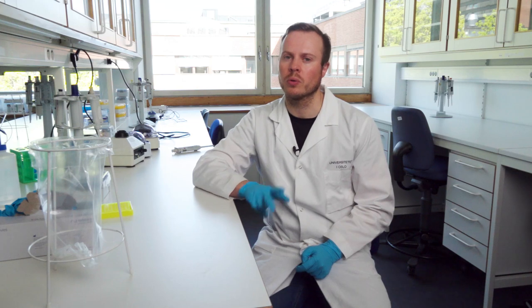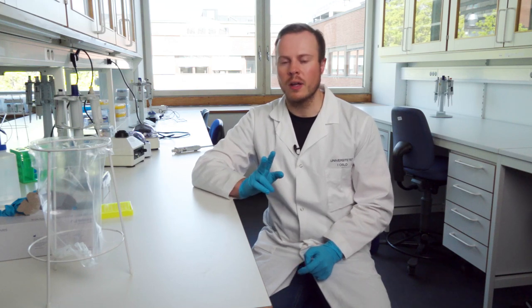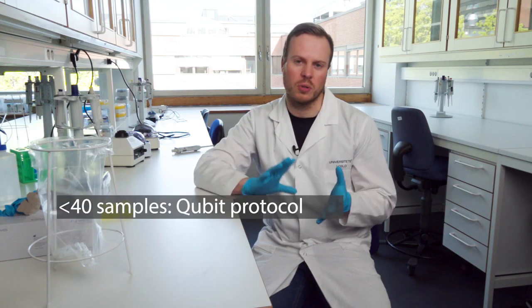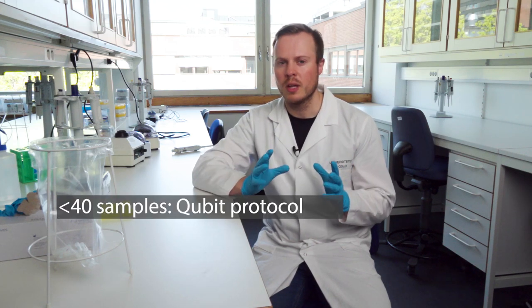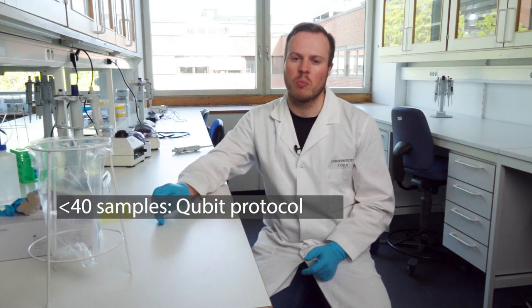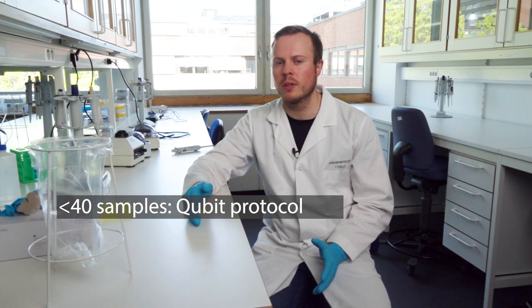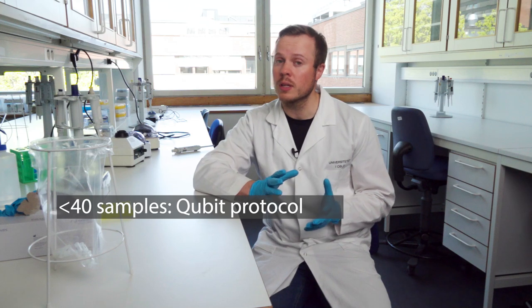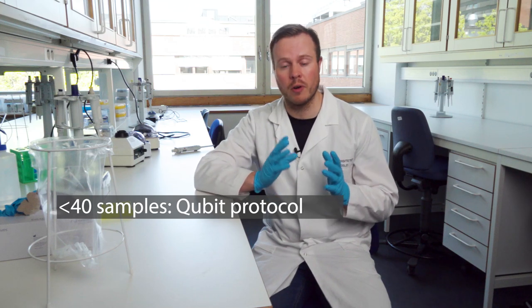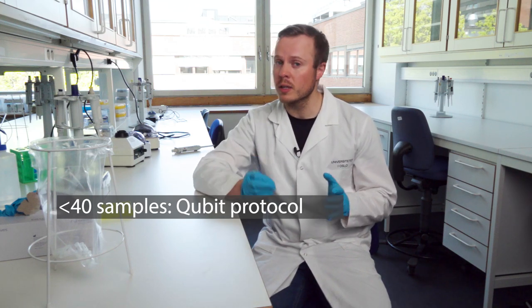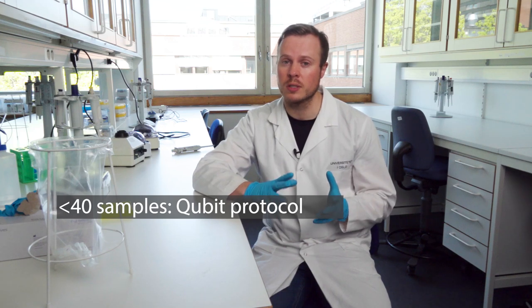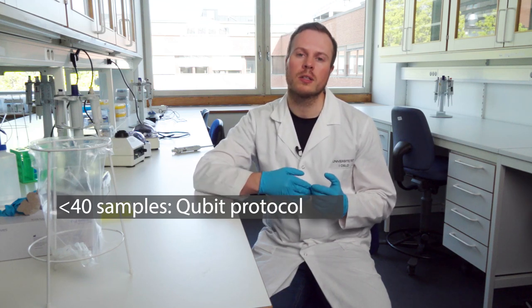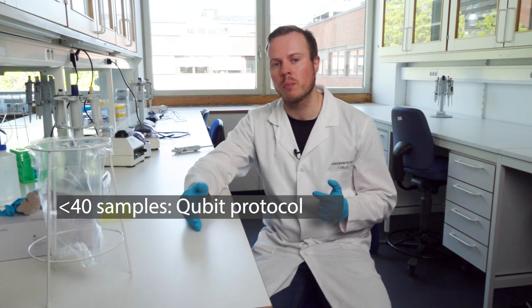We use two main protocols, and they are smart for two different sample sizes—that's kind of the main thing. If you have below I would say 40 samples, then you should use the Qubit protocol. The Qubit is very accurate, it's quite fast, it's very simple, it's an easy protocol to do. But it's more time-consuming if you get more samples.